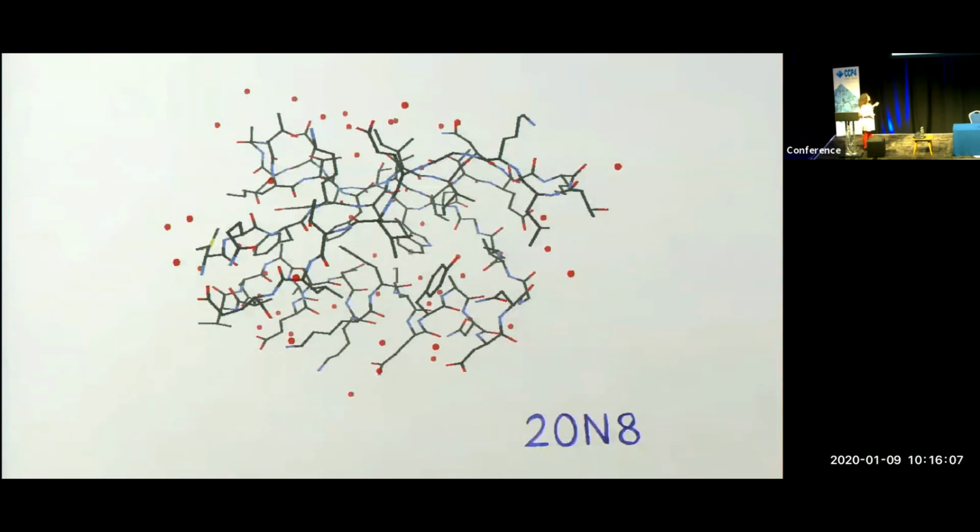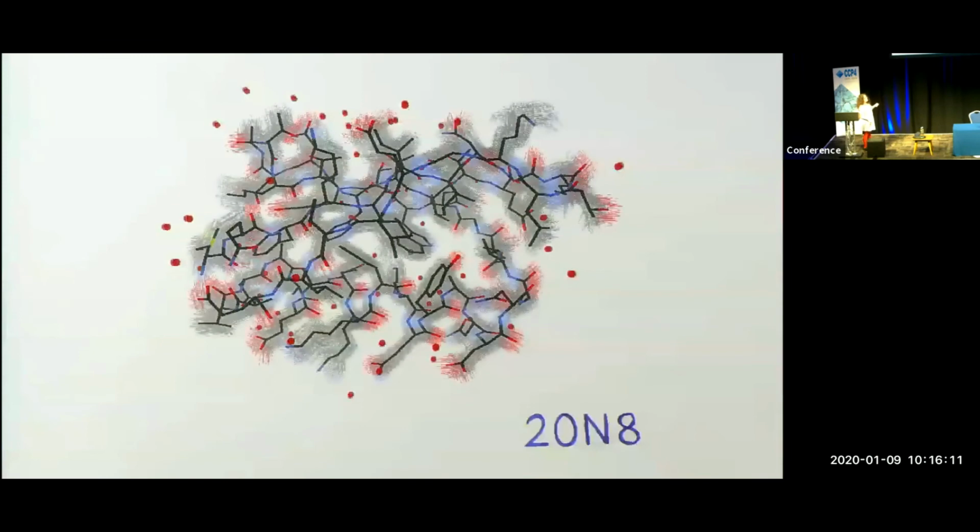This is also the average atom position from Vagabond, and it's actually representing a set of 120 individual structures which account for the flexibility of the molecule. And I'm going to focus on one loop region, and I'm going to show you various electron density maps now. So the first electron density map I'll show you is from atomistic refinement, essentially almost identical to the version from the PDB-REDO.